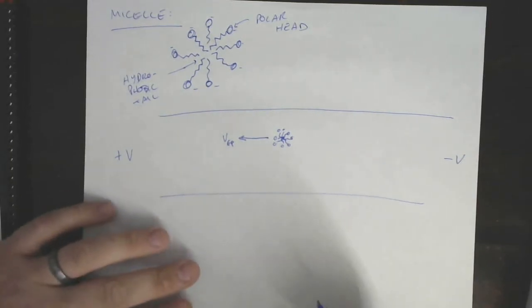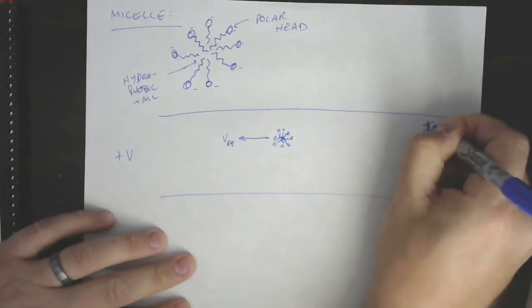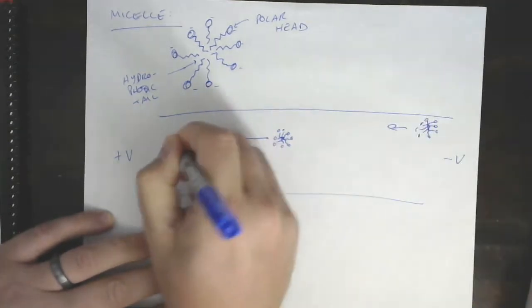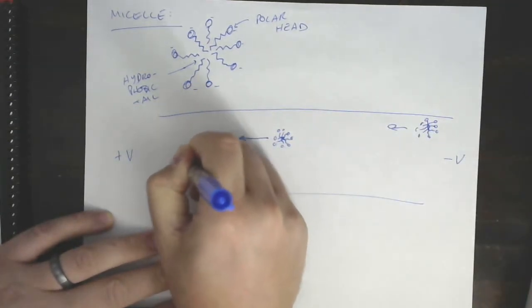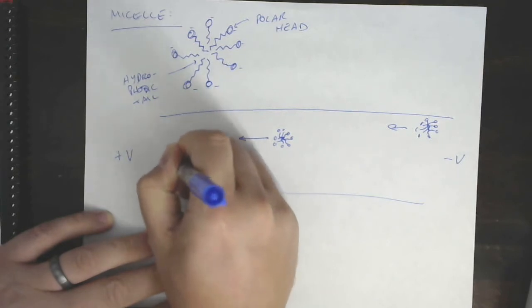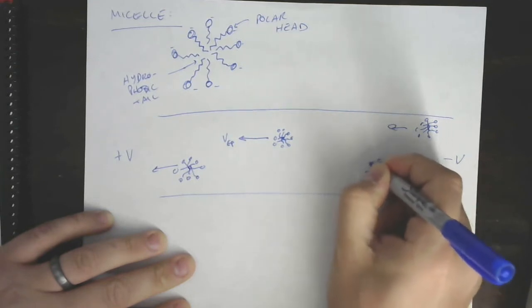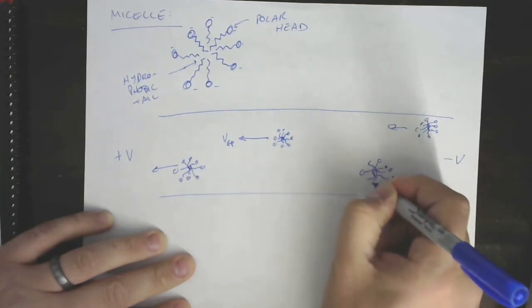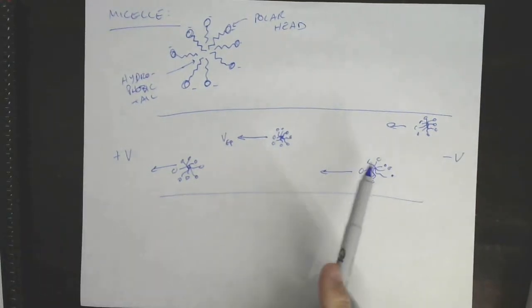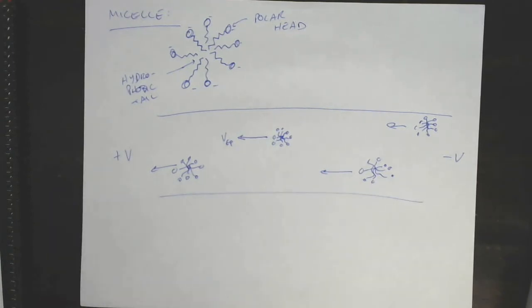That's because it's negatively charged, and there's our positive voltage. Okay, so we have more than one micelle in solution. In fact, they're everywhere. And they're not just everywhere, they keep entering the capillary because they are in those buffer vials that are at the entrance and exit of the capillary. So here's my very hastily drawn several micelles, and you can imagine lots of these things. We're at millimolar concentration. This is not nearly every micelle that would be in this picture.